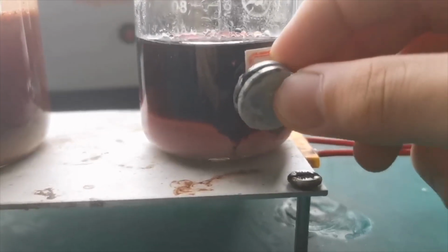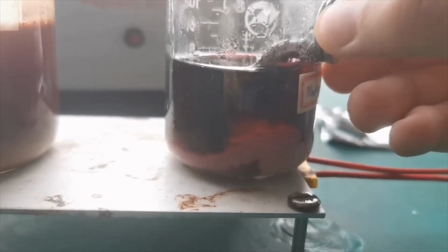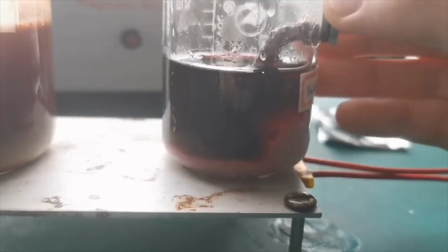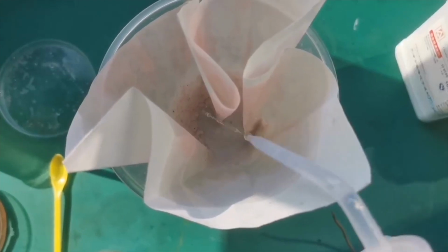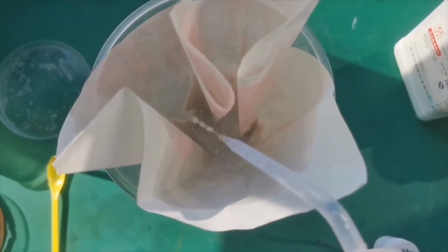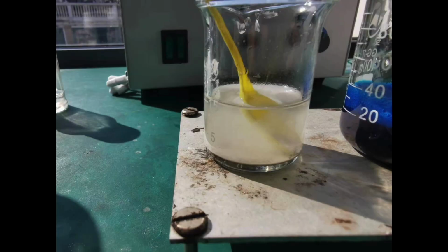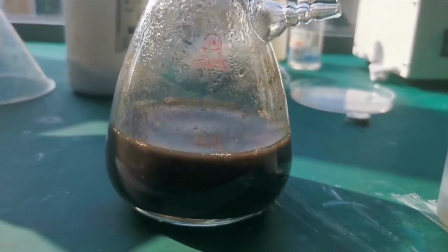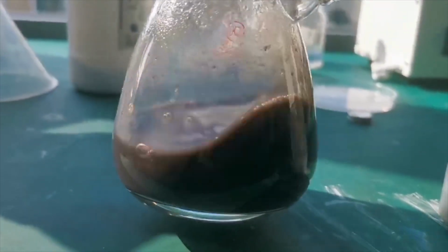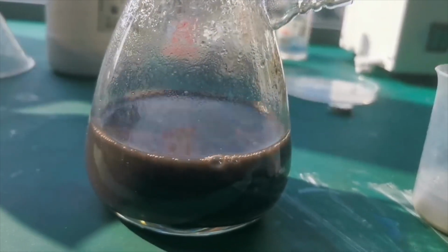It has cooled down a bit and a lot of crystals appeared, which is hopefully our lanthanide double salt. I removed the magnet, filtered the solution, and washed the precipitate. I was happy to see that it is perfectly white and not pink. I tried to recover the samarium inside it, but unfortunately it didn't result in anything, so I discarded it. I then processed the filtrate just as above by adding 10 grams of sodium hydroxide in water, and the same blue-black cobalt hydroxide precipitate appeared.